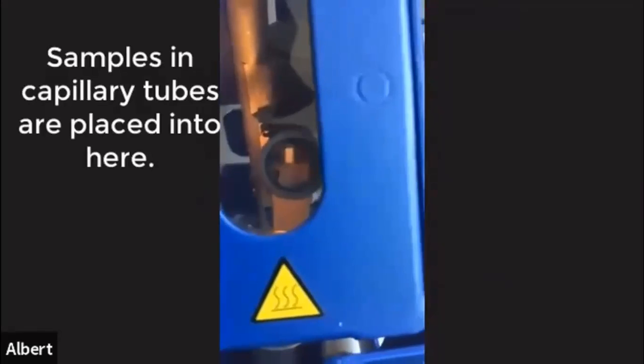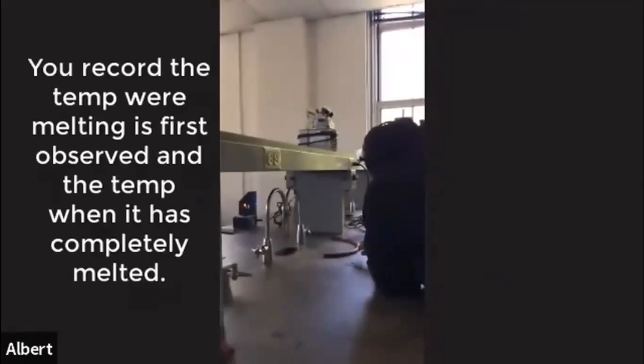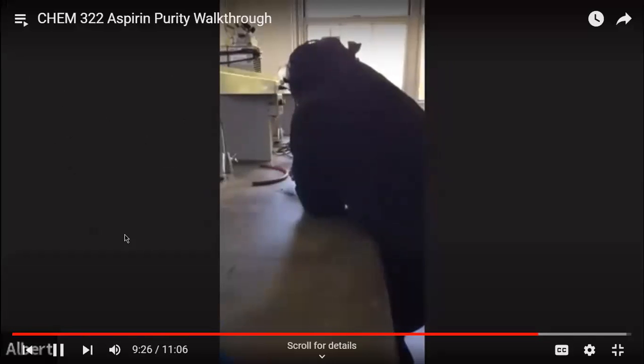So you kind of ramp the temperature up and you look through that viewfinder to see if your sample is melting. It's very important when you're doing a melting point to write down the initial temperature when your sample starts to melt, right? So if it starts melting at 120 and it stops at 128, that's what you record as your melting point, right? Because it's really a range and not really a point. So there's a range of temperatures that your aspirin is going to melt over and not just a single point.